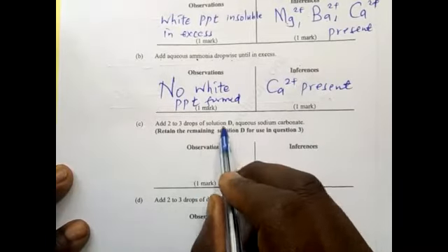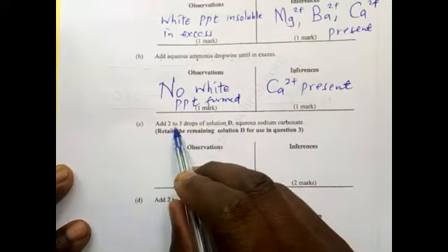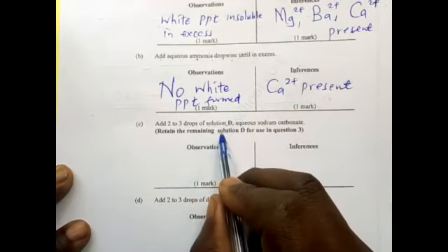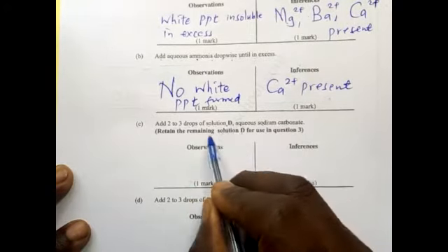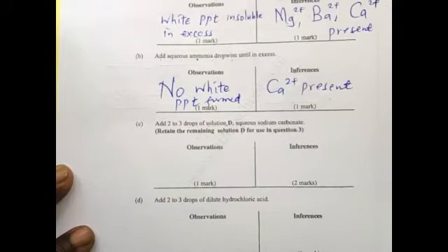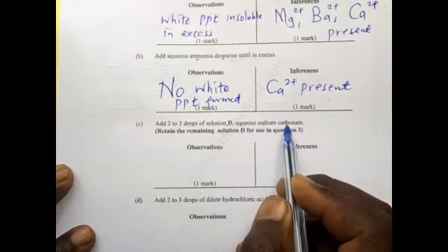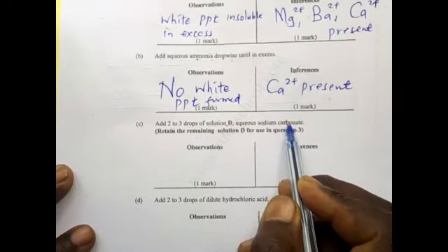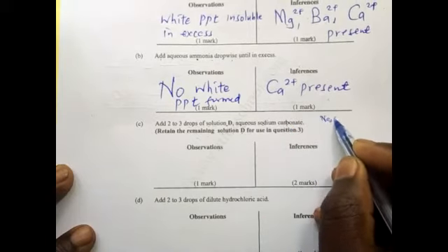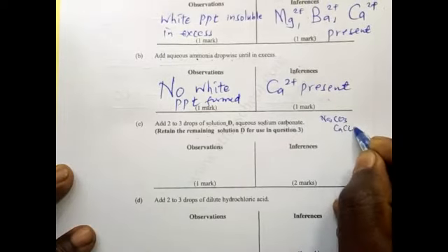C. Add 2 to 3 drops of solution D, aqueous sodium carbonate. Retain the remaining solution D for use in question 3. Right. So we are adding aqueous sodium carbonate. We expect that if there is calcium, it will form calcium carbonate.